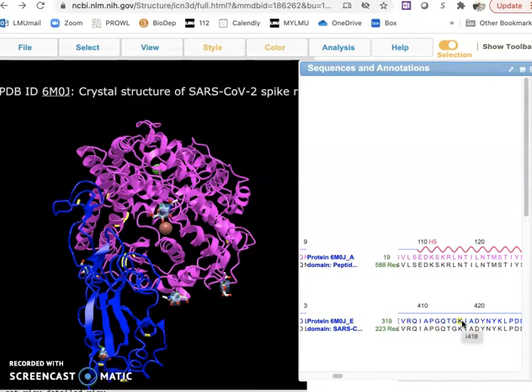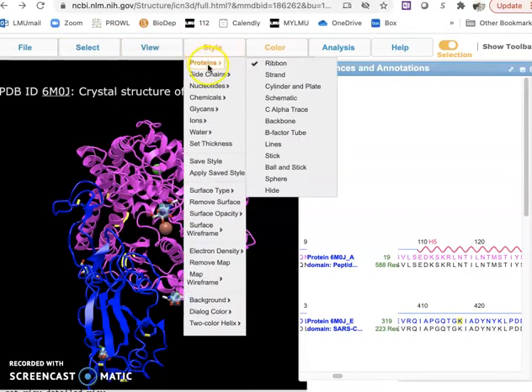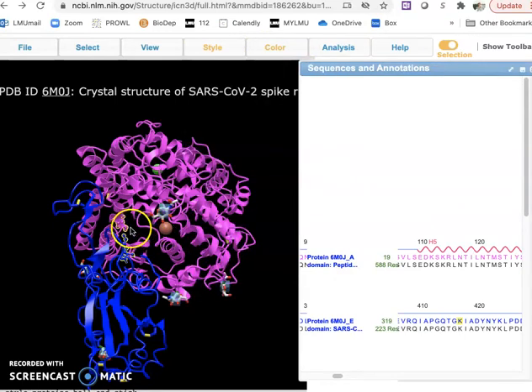Now I'm going to go to proteins, ball and stick. Right now, my selection is on, so I will be only working on the selected items. You could see ball and sticks appear with side chains here.